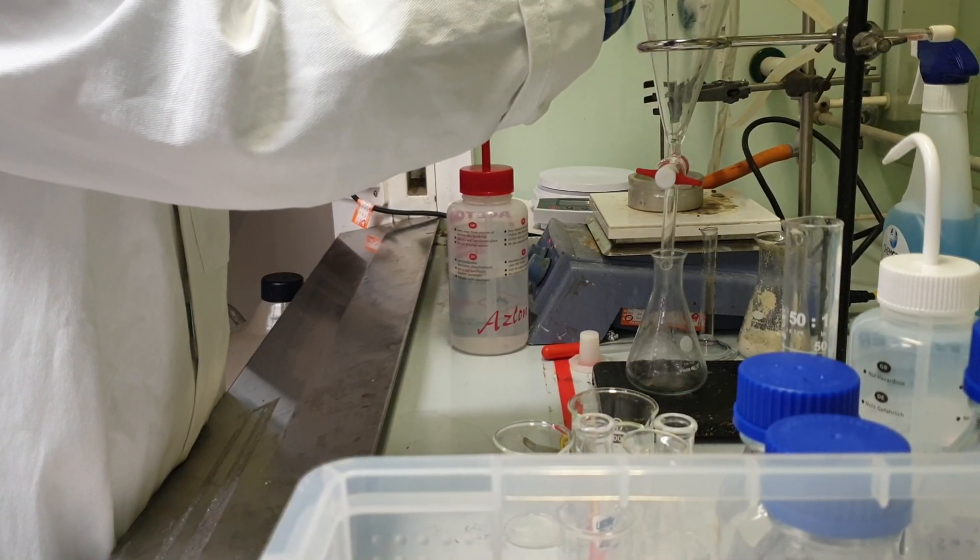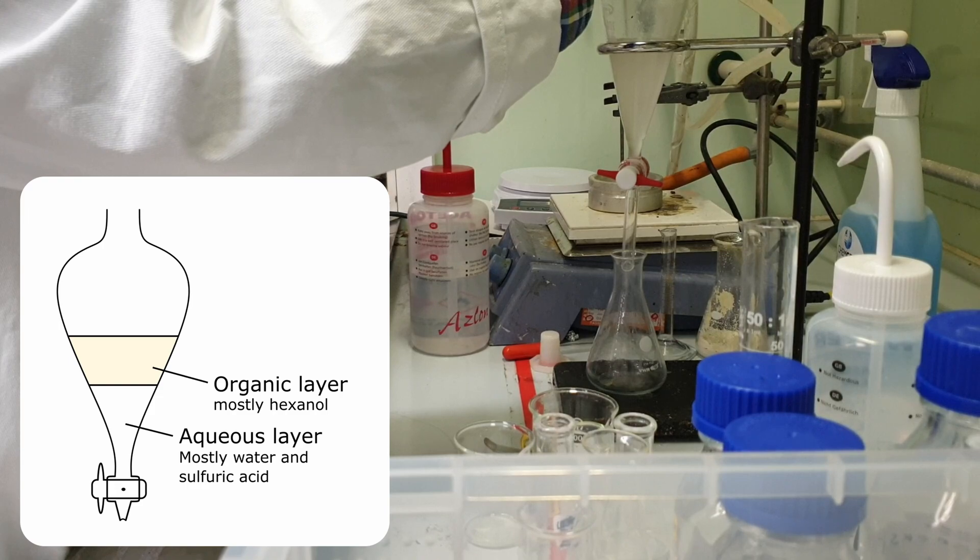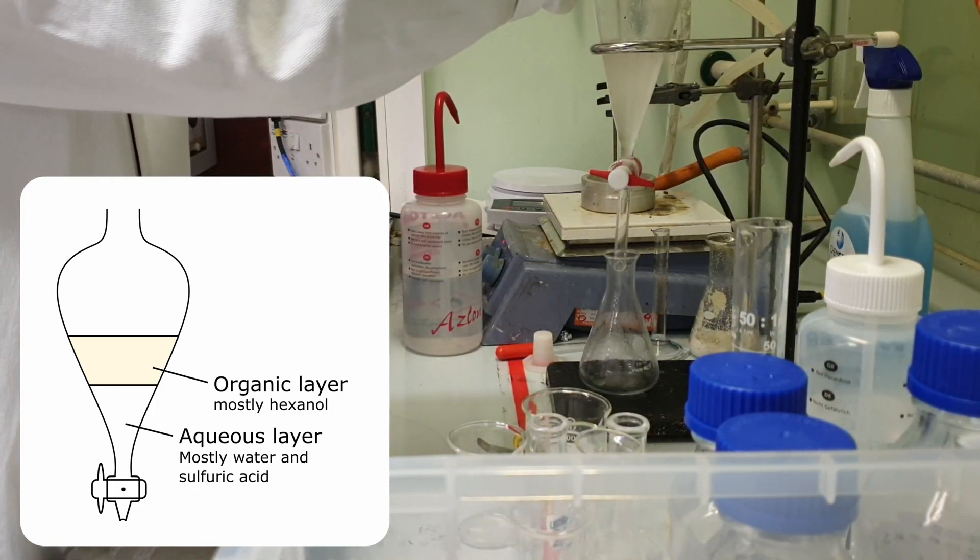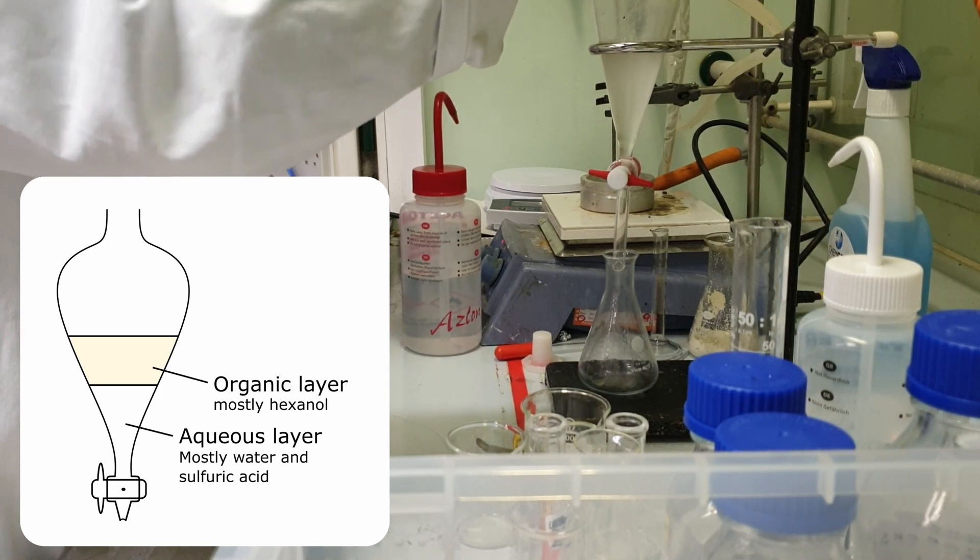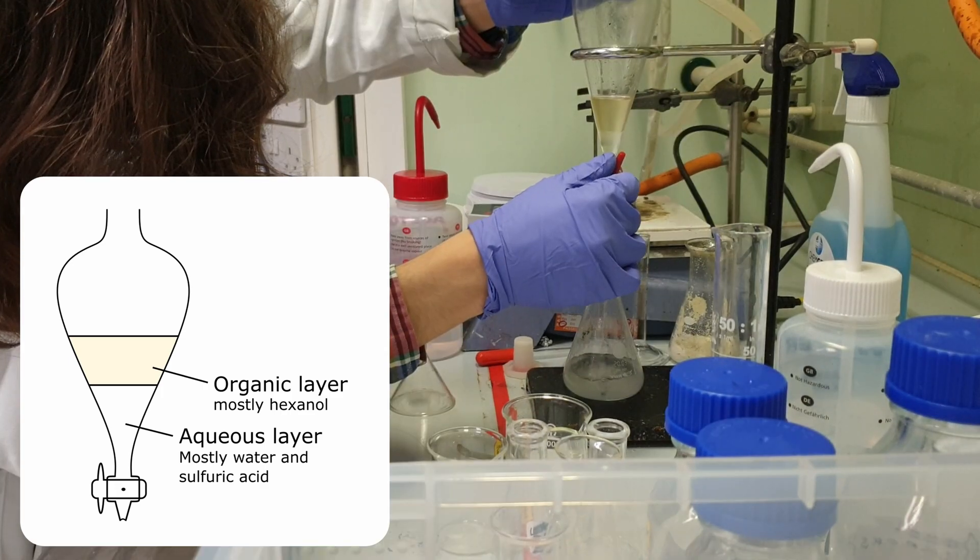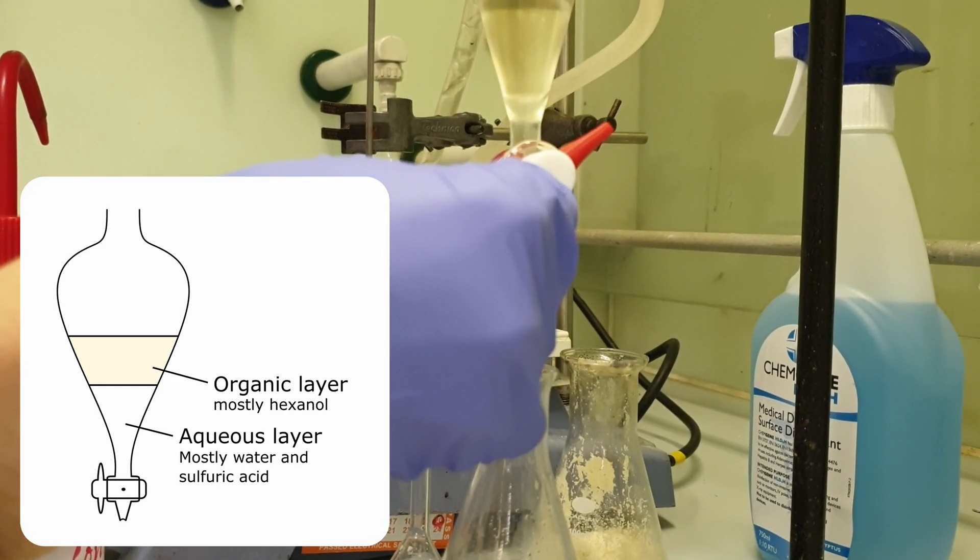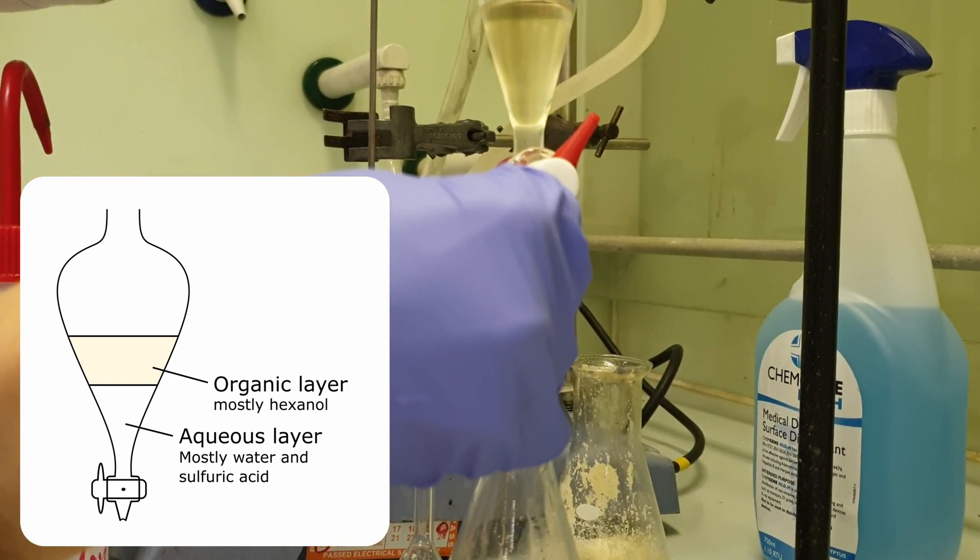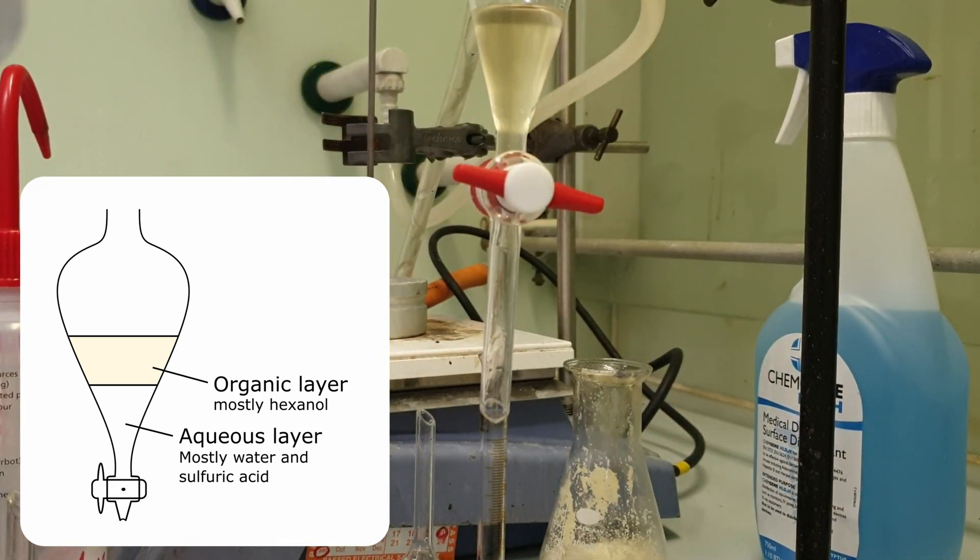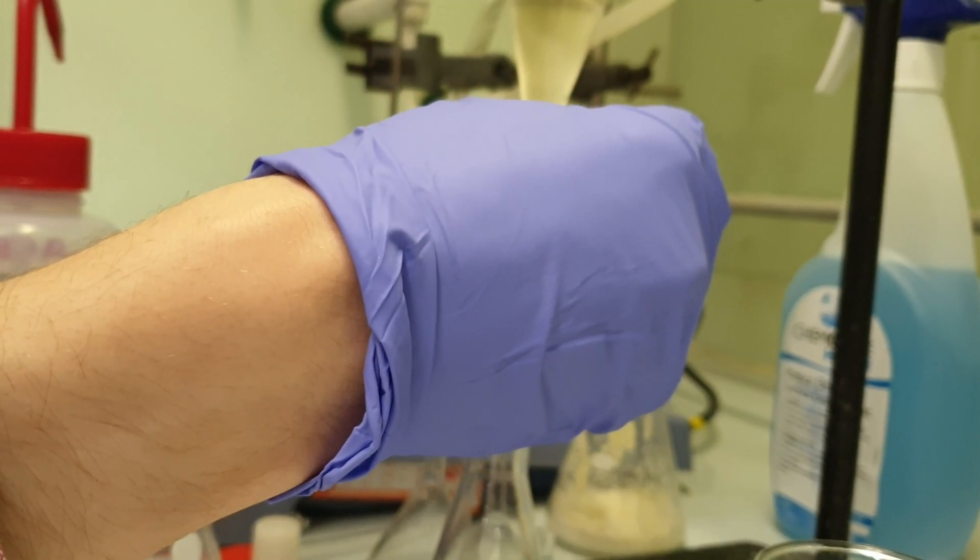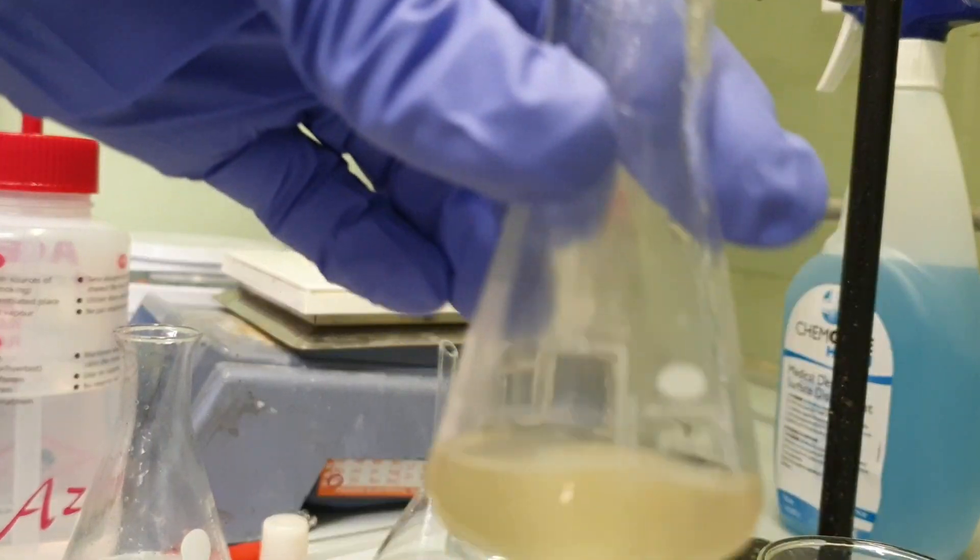Now that the reaction finished I'm dispensing it into a separatory funnel. I'll give it a minute for the layers to separate and then I will drain off the aqueous layer into the conical flask and label it accordingly. Here is my aqueous layer. I'm going to carry out some extraction on this with the ether. Here I'm draining off my organic layer into a separate conical flask.